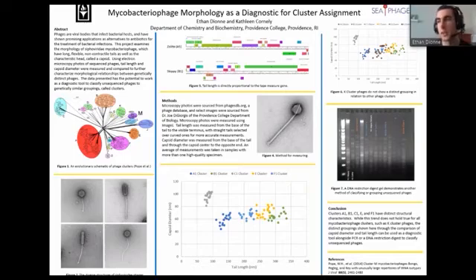phages, which is very useful to us because over the past couple of years, we've had freshmen in the fall have this research experience where they get to isolate their own phage, and we have to choose 2 phages to be sequenced. We want to discover new, unique, potentially useful phages and phage therapy on our campus, like we did with Zoe J in 2012. So this kind of data is very promising to improve our results with the freshmen to get more interesting phages on our campus. That's my project. Thank you.